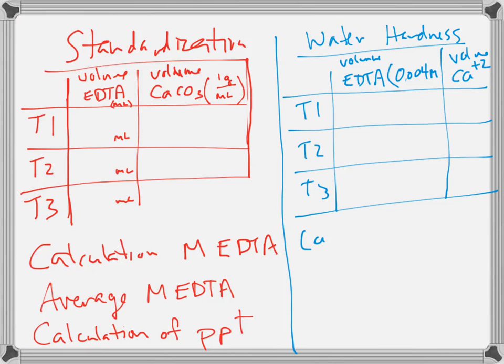Now your calculations for our water hardness, for each of those trials, and now also an average.